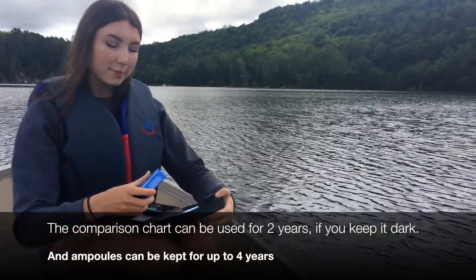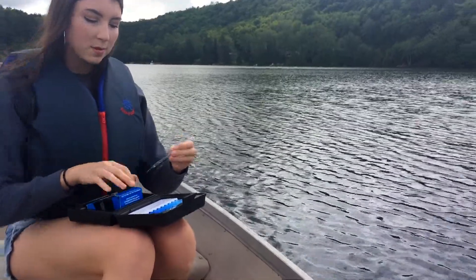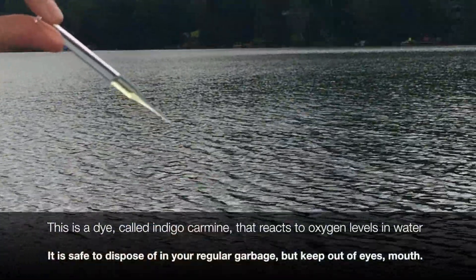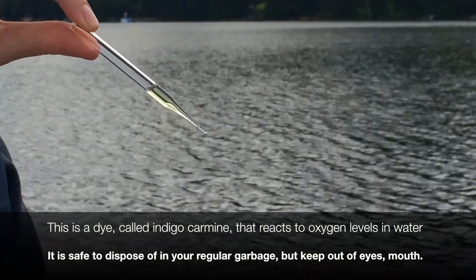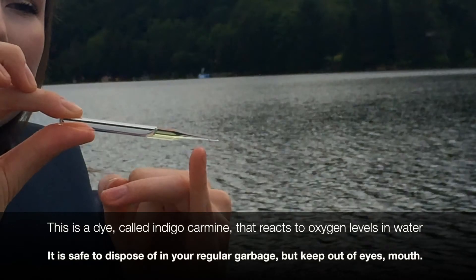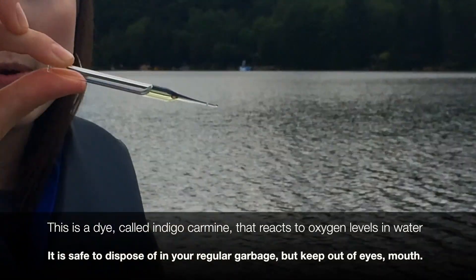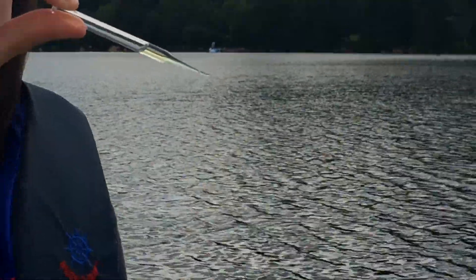We start the test off by taking an ampoule out of the box, and you'll notice that the ampoule is filled with a yellow liquid. Inside here are chemicals that are going to react with the oxygen that's in the water. You might also notice that there's a little white piece on the glass here, and that's a weak point in the glass — it's designed to break very easily, and that will come in very handy when we do the test.